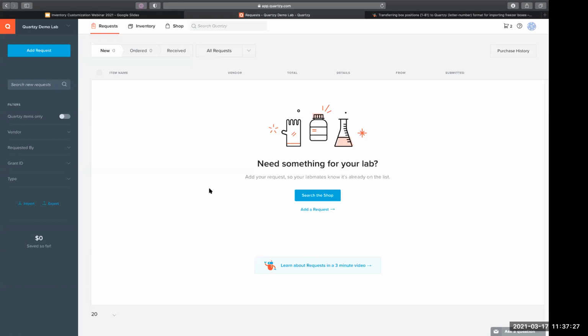As long as I know that there's going to be a decrease in the number of boxes, like X number of boxes every month. And then by the time it goes below that certain number, there's an automatic addition to the new requests. That will do it for me in the case of those high consumption rate items.